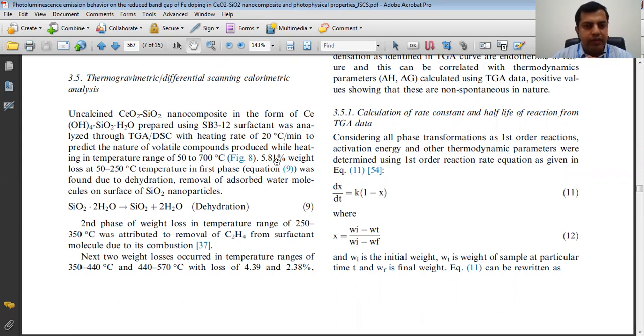In this way you can calculate the weight loss and identify which molecules are removing from the second phase and third phase. If there is 5.81% weight loss from 50 to 250 degrees centigrade, then there is removal of two water molecules. This process is called dehydration. The water molecules absorbed on the surface of silicon dioxide are being removed.